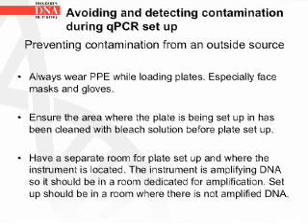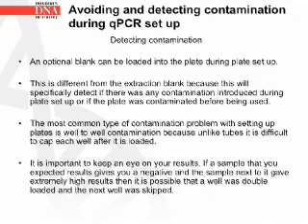Always wear your PPE while loading the plates, especially face masks and gloves. Ensure the area where the plate is being set up has been cleaned with bleach solution before the plate is set up. Have a separate room for plate setup and where the instrument is located. The instrument is amplifying DNA, so it should be in a room dedicated for amplification. The setup should be in a room where there is no amplified DNA.